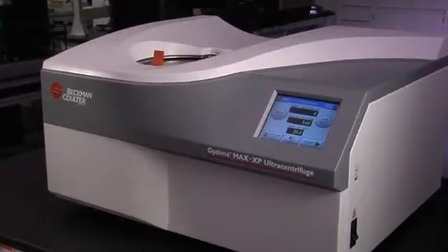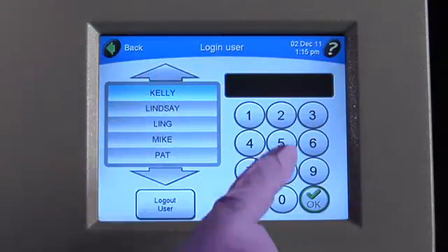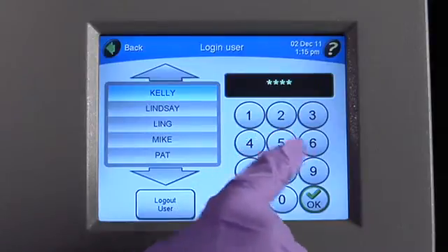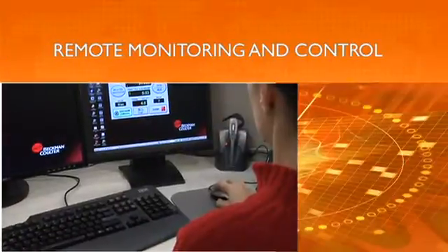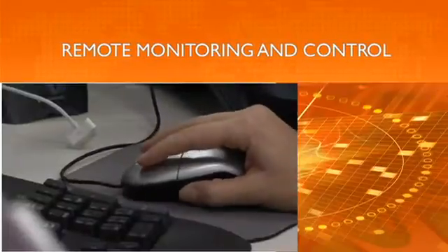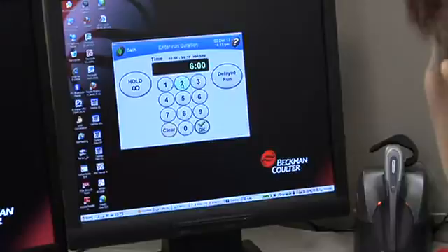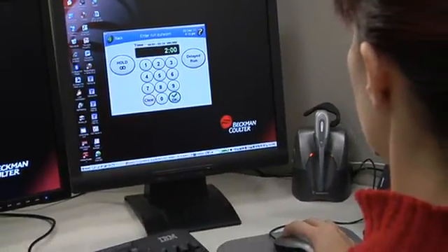The Optima MaxxP's interface is customizable and is easily personalized with easy-to-identify icons for up to 12 users. The Optima MaxxP's remote monitoring and control capabilities save valuable time. With the remote control kit, you can readily start, stop, and monitor the system from any computer.